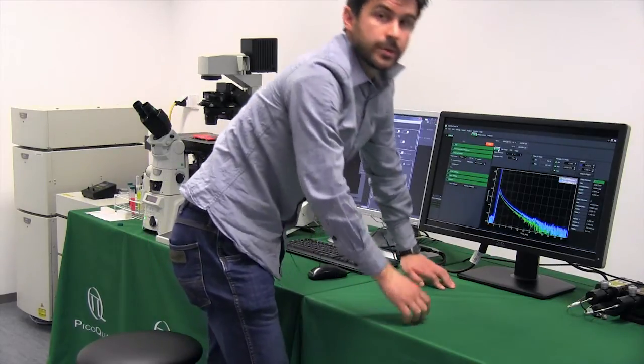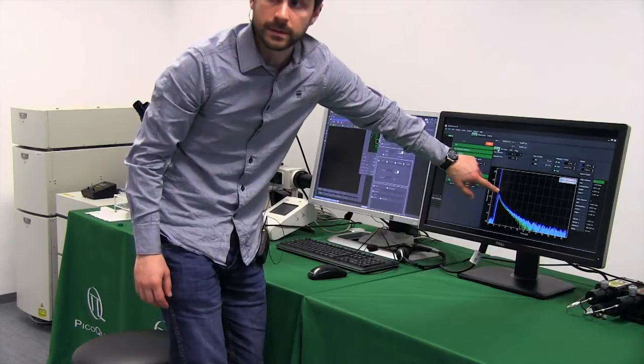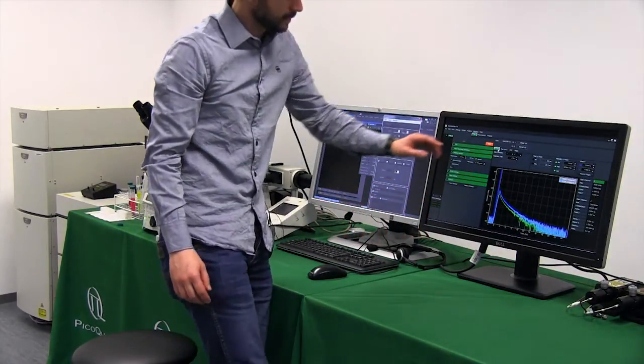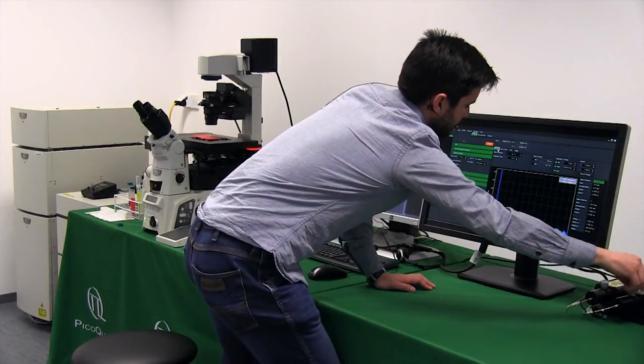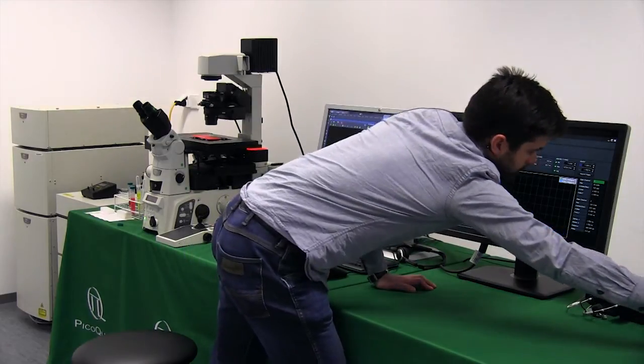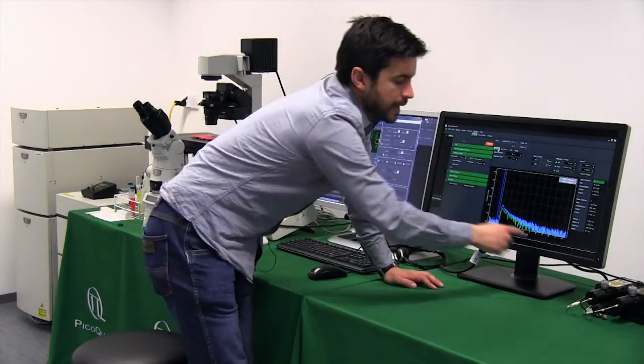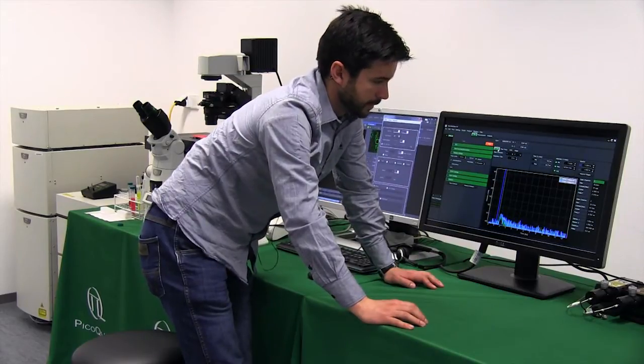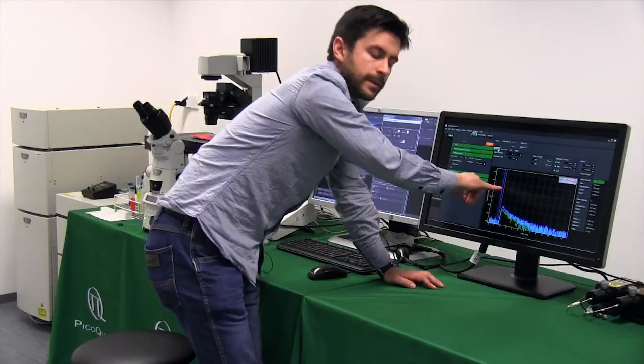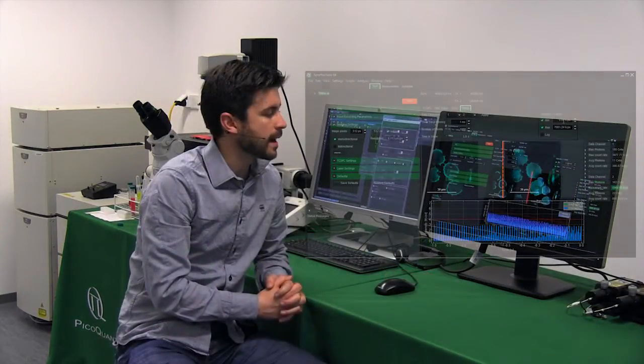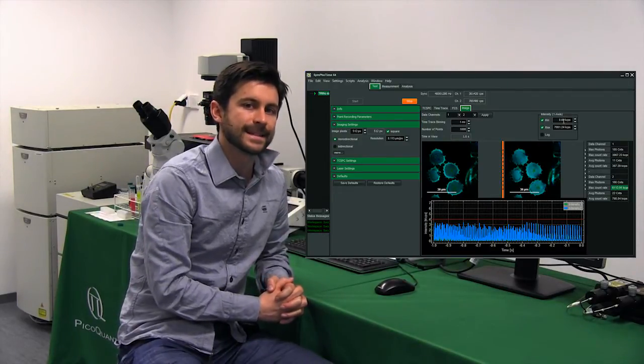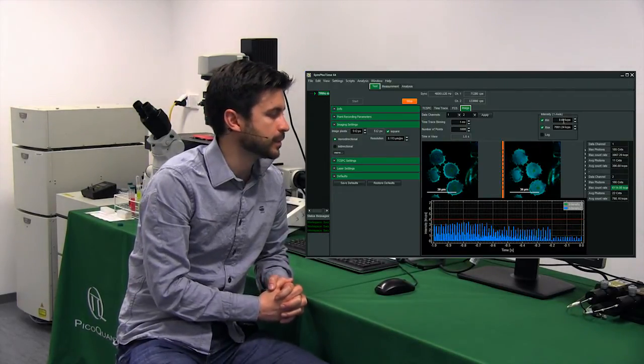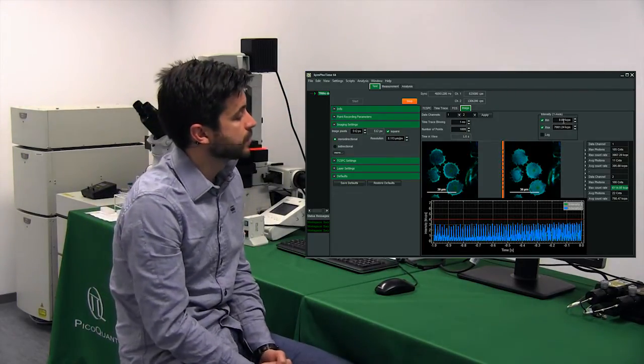Of course when you check the repetition rate you have to make sure that you've got enough counts. Here we've got 10 to the 4 counts because if the intensity is too low and then you put 80 megahertz you will never cover the whole window. So at least you have to have in the order of 10,000 counts. Once we have determined the repetition rate we want to measure with, the next step is to set a proper count rate for the measurement.